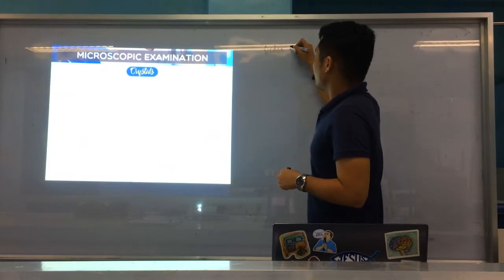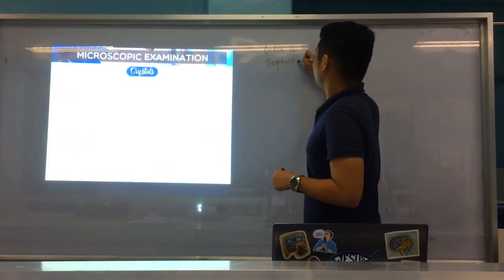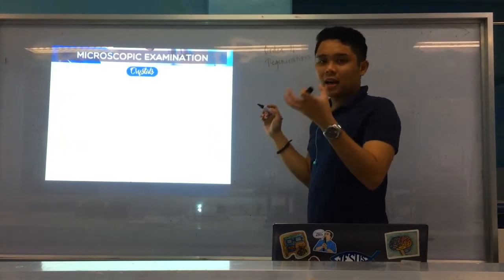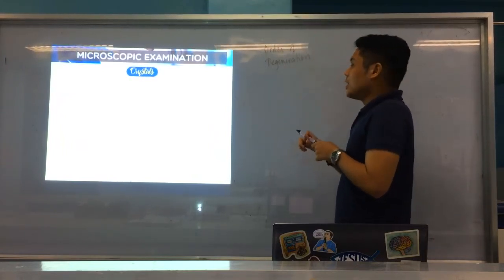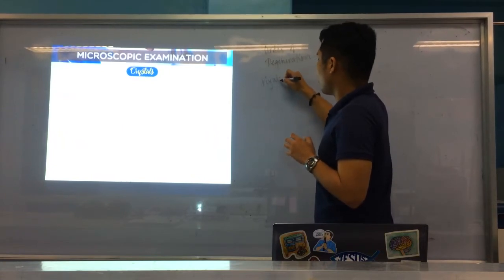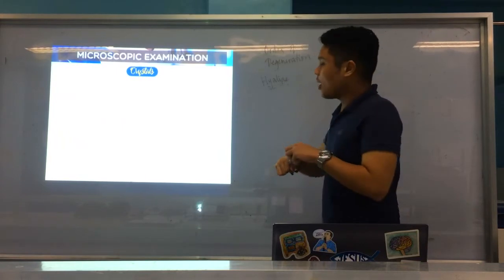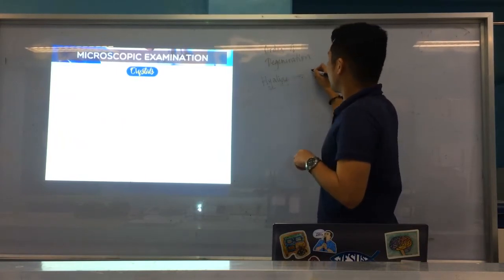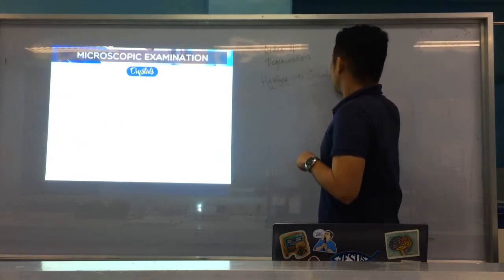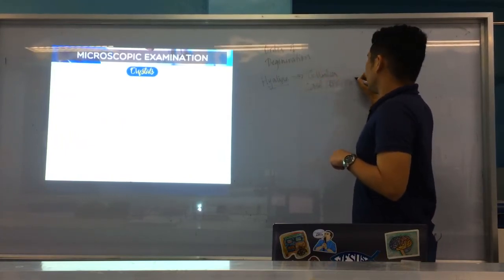of degeneration. Meaning, the steps in casts, in a way, generally. So we'll start first, of course, with hyaline. Always take note, the first type of cast is hyaline. Followed by your cellular cast. So, of course, the cellular cast here could be either RBC, WBC, etc.